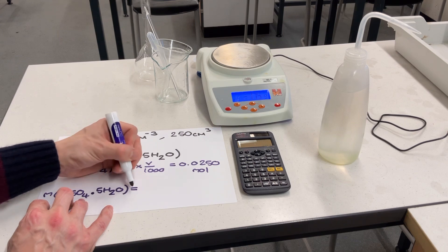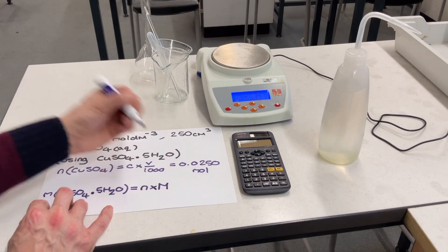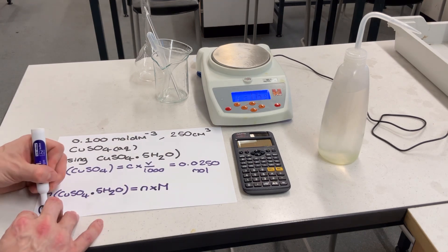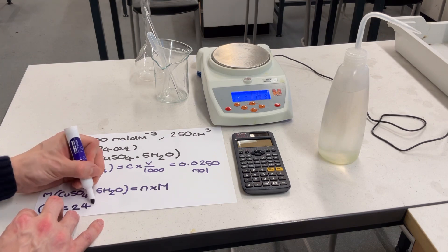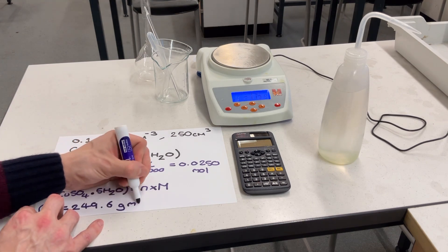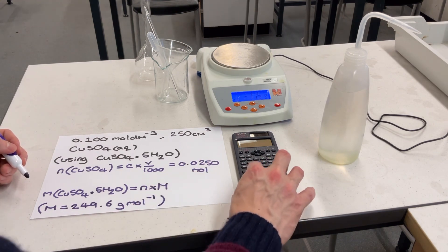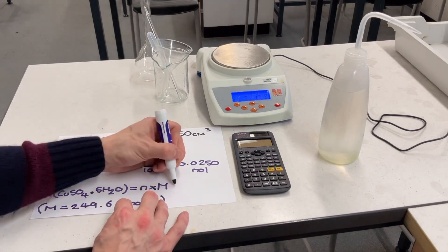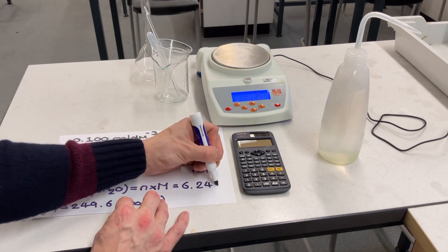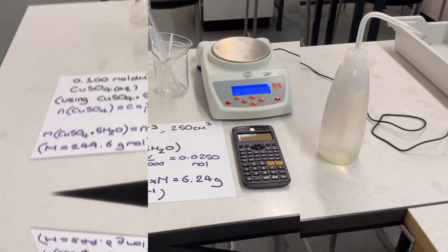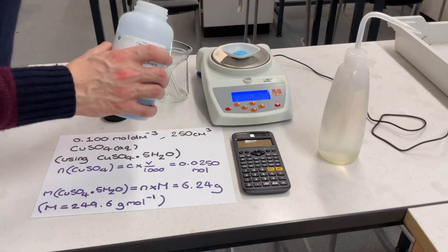be sure to check for this and then perform the calculation you can see on screen now to deduce the mass of solid required to prepare our standard solution. Here I'm using hydrated copper sulfate, which is absolutely fine, so long as I then use the hydrated copper sulfate molar mass in my calculations to prepare my 250 centimetre cubed standard solution.